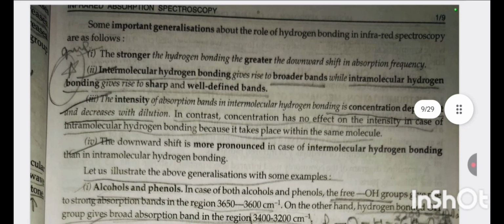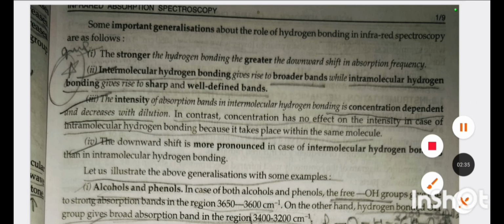Some important generalizations about the role of hydrogen bonding in infrared spectroscopy are: first, the stronger the hydrogen bonding, the greater the downward shift in the absorption frequency. Second, intermolecular hydrogen bonding gives rise to broader bands, while intramolecular hydrogen bonding gives rise to sharp and well-defined bands.